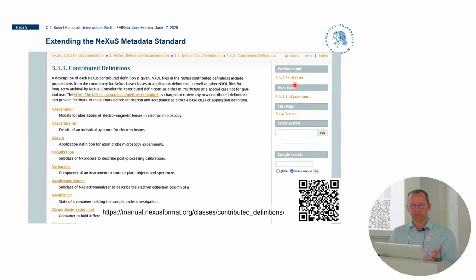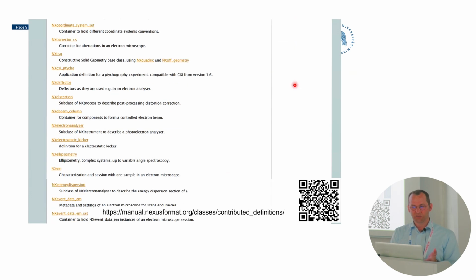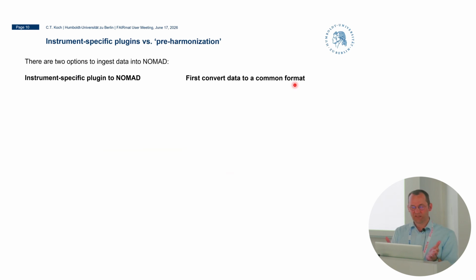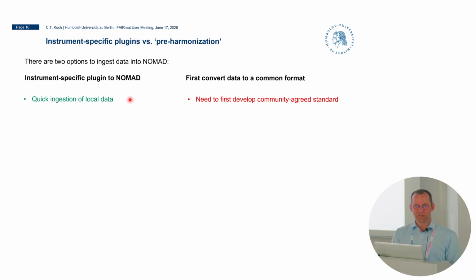And so this is why this NeXus standard has been developed, where electron microscopy is also part of it. And of course, there are many roads that lead to Rome, as we say in German. So there are, of course, a number of plugins being developed for specific techniques, which have their place, definitely, because they have the advantage that if you are a programmer and you can write this plugin, then you can quickly ingest your data into your NOMAD Oasis instance and visualize it. You have basically a short time until you have results available.